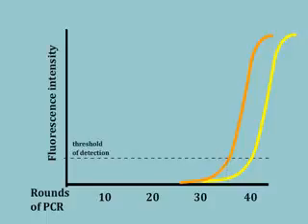And if there were 1024 more target DNA sequences in the original sample, then the fluorescent signal would be detected 10 rounds earlier. So the amount of specific DNA in the clinical sample is determined by reference to the round of PCR in which the amount of fluorescence first crosses the threshold of detection.